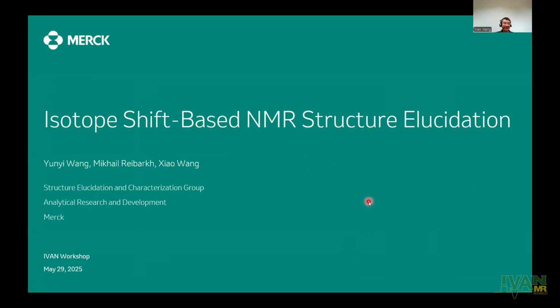Okay, thanks, Thomas. So, good afternoon, good morning, everyone. This is Xiao from Merck Structure Elucidation Group. So I'll follow Thomas' story. I'll talk more about the follow-up development of the i-HMBC methodology and what we call the isotope shift-based NMR structure elucidation strategy. Most of the work I'm going to talk about today was done by Yunyi, but she's on maternity leave right now, so I'm presenting on behalf of her.